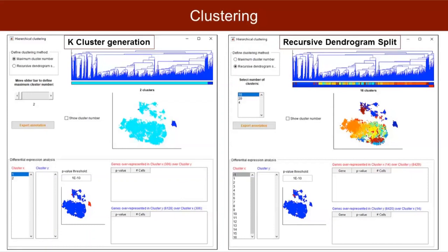I just wanted to clarify that our t-SNE plots here look different because we decided to perform the analysis with splenocytes only, excluding lymph node cells. The reason for this is that the immunization time point we used was ideal for splenic germinal centers, but already too late for lymph node cells.